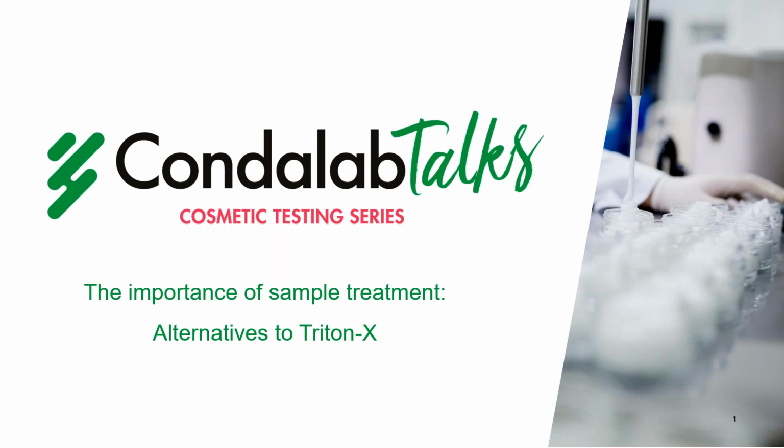And today, as you can imagine from the title, we will talk about the importance of cosmetic product samples treatment and also the recent ban on Triton X 100 and its effects on our analysis.